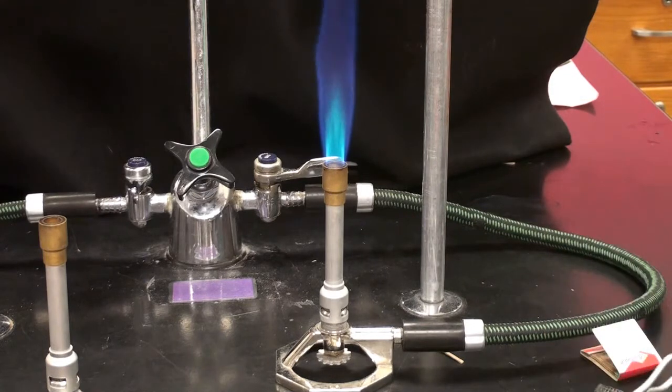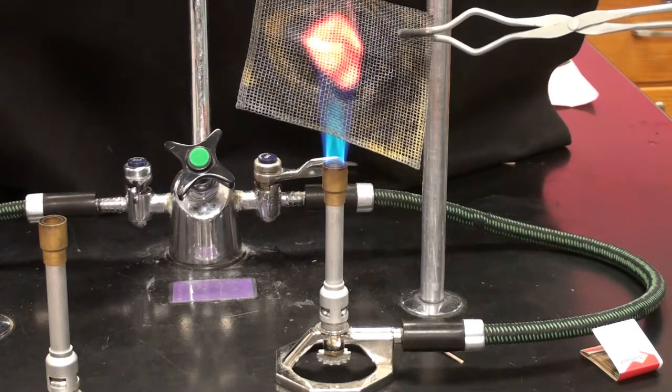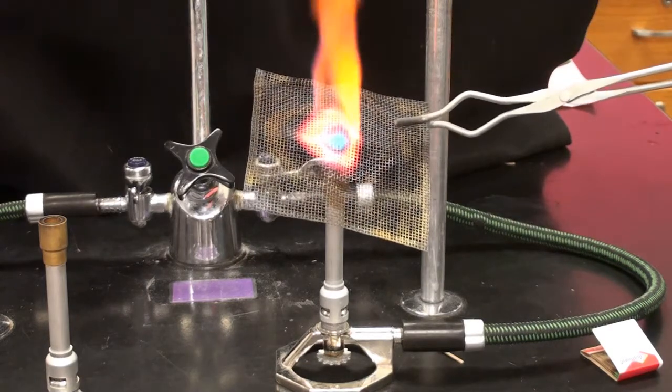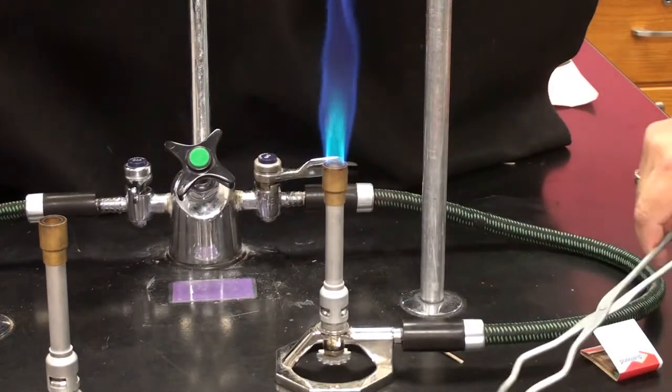Let's look at it one more time here. So above that blue cone, there we go. That's pretty hot. But inside that blue cone, not as hot on the inside. Let's check the two wires.